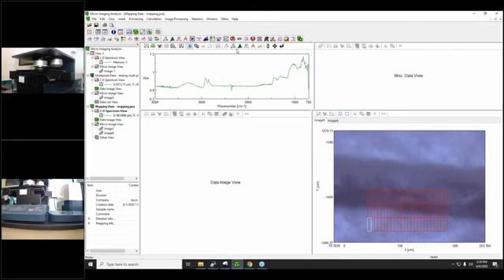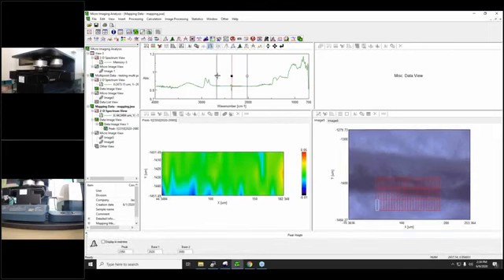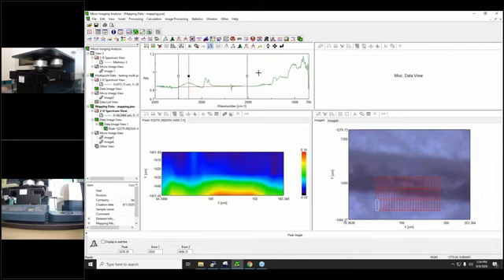We are going to create this map based on functional groups. For this polymer, we are going to use this functional group here that is around the 3200 wave number, and this is related to the OH functional group.